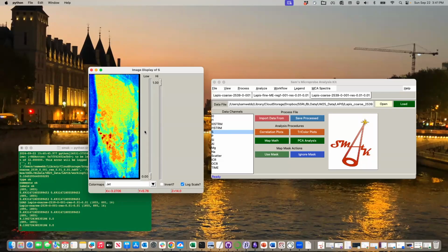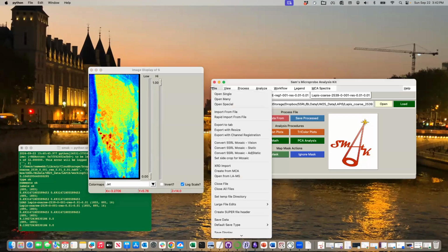And so now, if we're lucky, I'm going to import the multiple energy data from this file into that one. Because now we're at the same resolution, we have the same energy areas, we can do that. The tricky part here is if you say import data from, which is the cute little button here, this is the automatic rapid import. It better be the same data size and the same step size. We don't have that case, so we need to go to the old school import, not the quote unquote rapid import, which is what the button does.